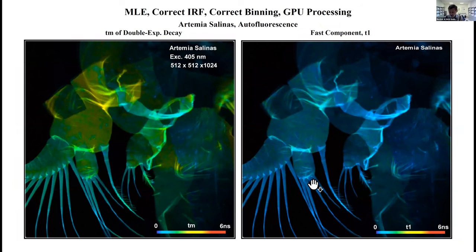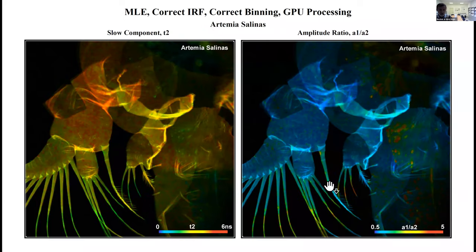If you put this all together—maximum likelihood, correct IRF, correct binning, GPU processing—you are able to record and analyze wonderful images. I couldn't resist to show you some of them. This is Artemia salina, a little salt water shrimp. This is autofluorescence image lifetime.